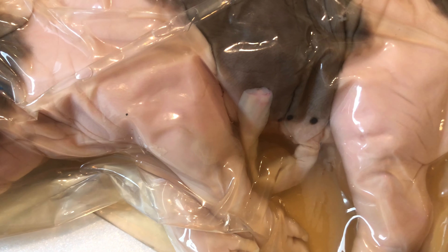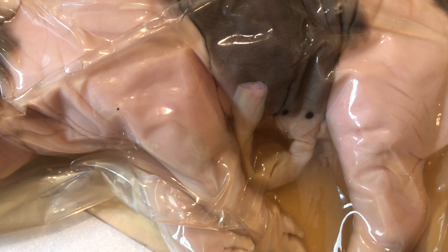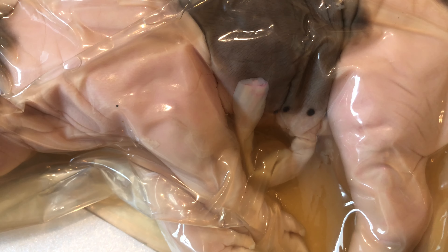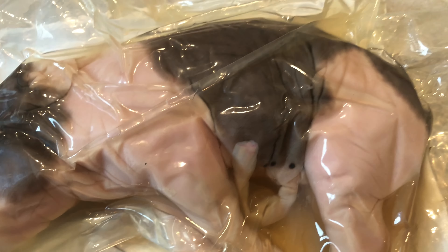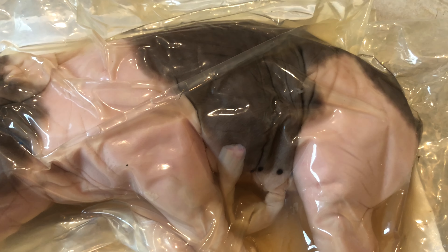One observation I noticed is the fetal pig has eyelashes. I didn't think a fetal pig would have had eyelashes yet, but this one does, which is pretty interesting to me. I was looking around and I saw this - at first I thought it was maybe its penis, but I think it's just the umbilical cord. I think male and female pigs both have these.